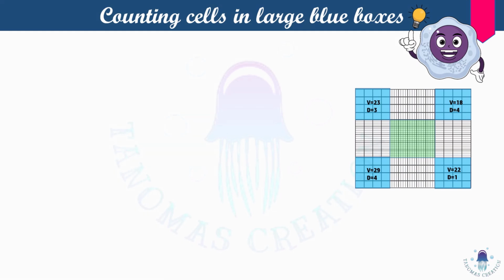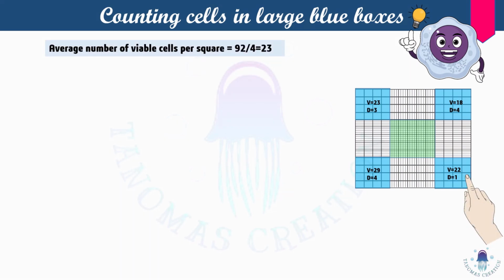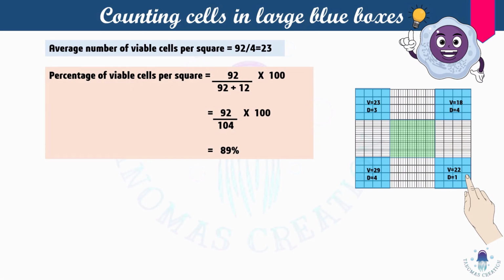Okay, so we'll find out the average number of viable cells for these same squares. The average number of viable cells per square becomes 92 divided by 4. Remember the number of squares you have counted, that is 4, right? So it becomes 23. Now if you want to find out the percentage of viable cells per square, we need the total number of viable cells divided by total cells into 100. So viable cells was 92 divided by total cells, that is viable plus non-viable, 104, into 100, which gives 89%. So we can say there are 89% viable cells present per square, right?